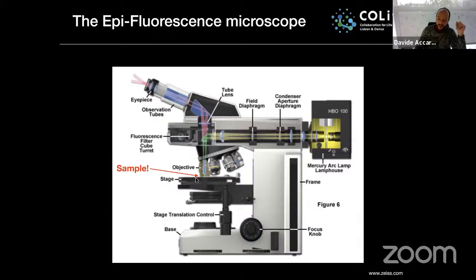Then your fluorophores will be excited, and when coming back to an energetic level called the ground state, they will emit photons. These photons will be collected partially by the objective and will travel back upwards. Once encountering the main beam splitter again, since the emitted light is typically longer in wavelength than the excitation light, they will pass through.